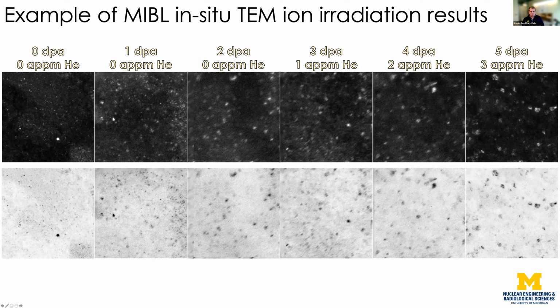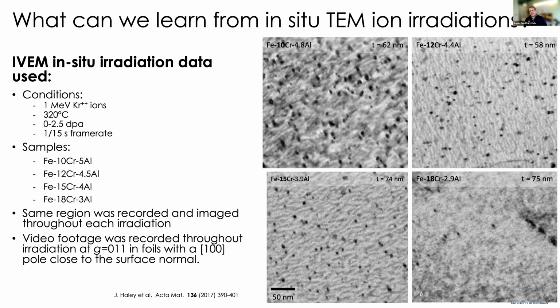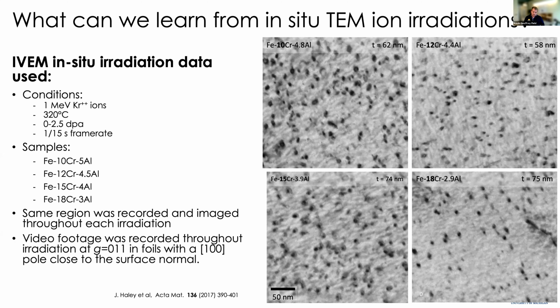I don't remember the exact g-factor that my student was running, so I can't answer that, but I could figure it out and email it to you. Typically for BCC steels, body-centered cubic steels, you'd be imaging on the 100 zone axis, with g vectors like 111, 011, those types of g vectors. There are some nice papers that describe that in quite grand detail. Good question though.